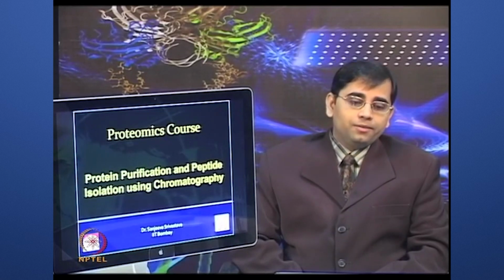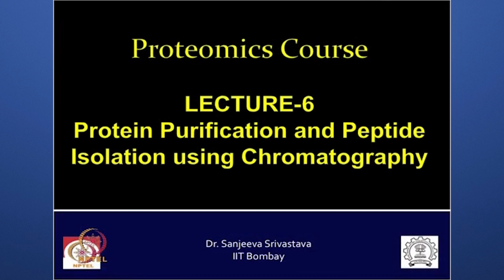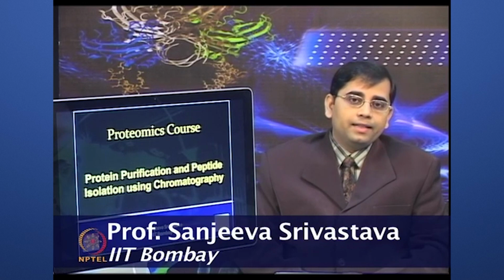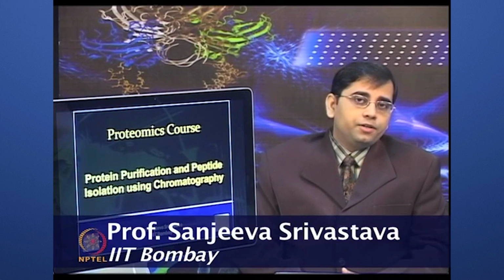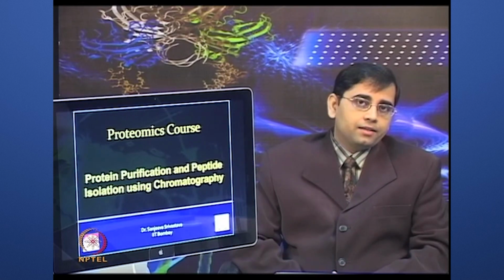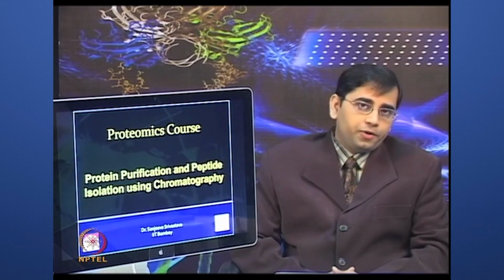Welcome to the Proteomics course. Today we will talk about protein purification and peptide isolation using chromatography methods. The chromatography techniques have always been considered prominent for the separation of enzymes and proteins. Protein purification by conventional chromatography is usually achieved by combining chromatographic methods such as gel filtration, ion exchange and affinity chromatography.